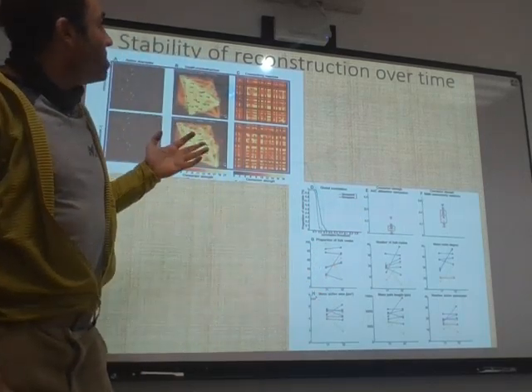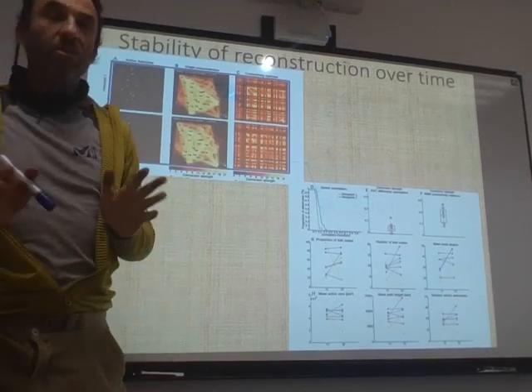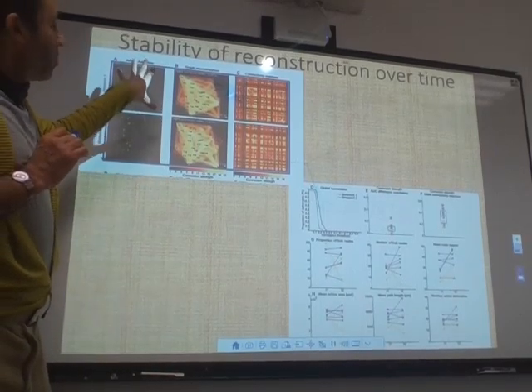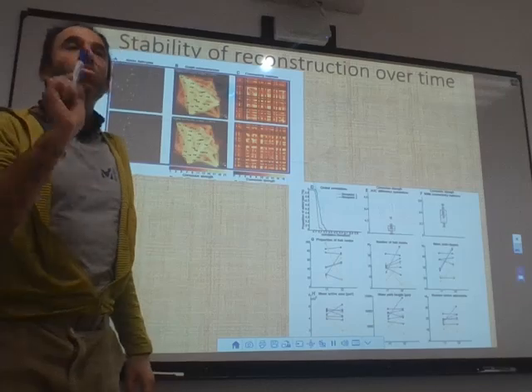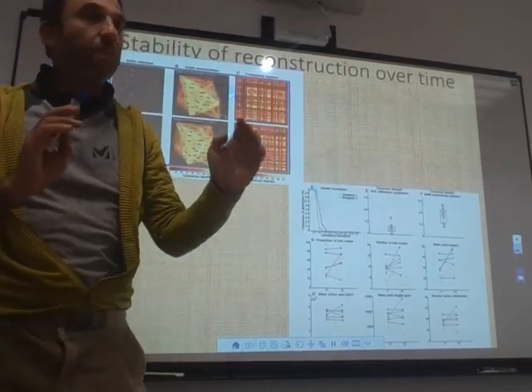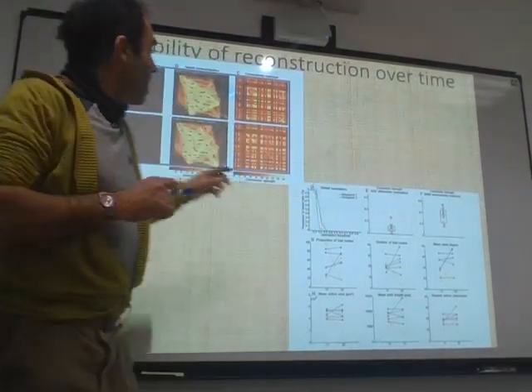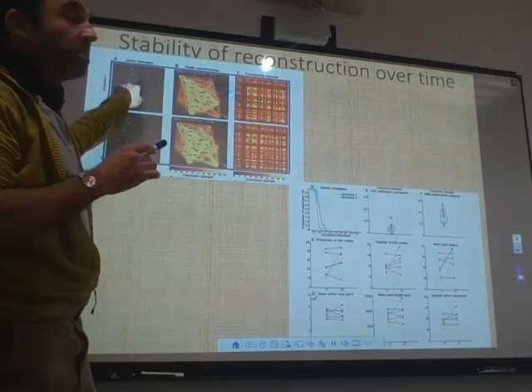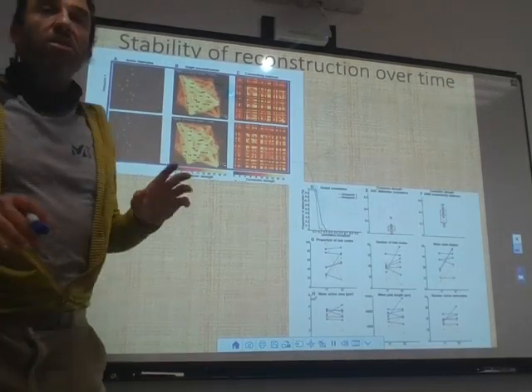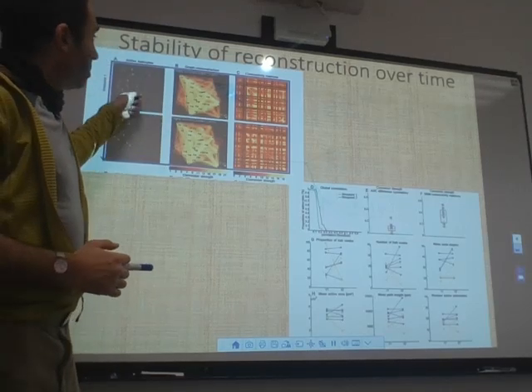So then we moved to something called time-lapse analysis. We said, okay, let's record at a time t1. Let's apply all the pipeline to time t1. Let's record later in the future at time t2 without mixing the data. And do we get the same reconstruction matrix? So that's what we did.